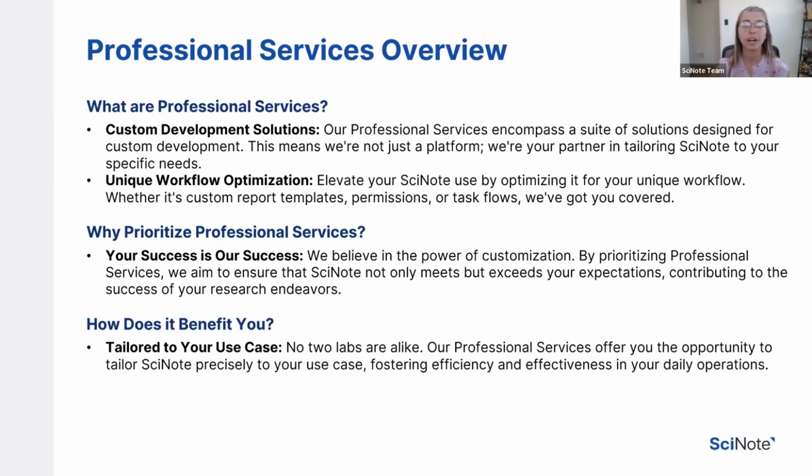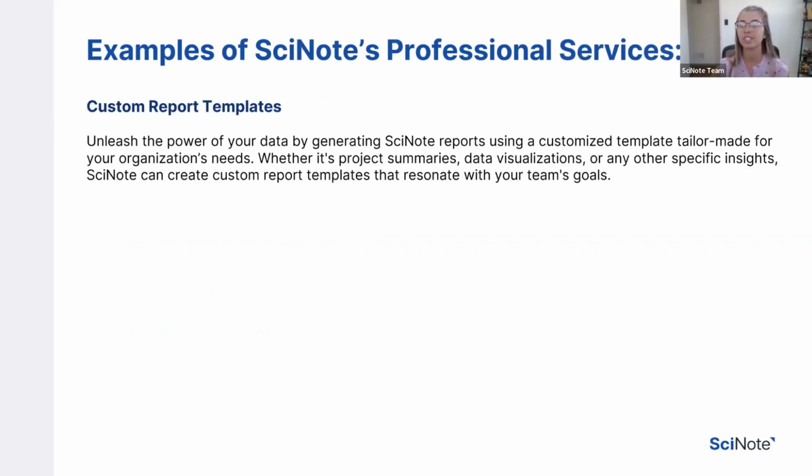Today we're going to go over three examples to illustrate how we've created solutions for some of our users already. What we're going to start off with is custom reports.